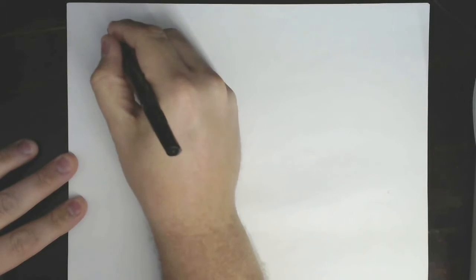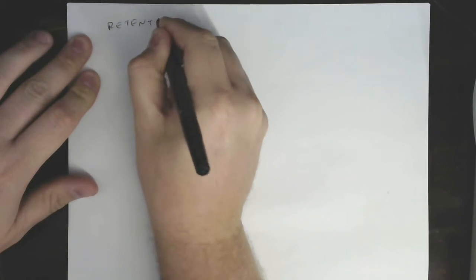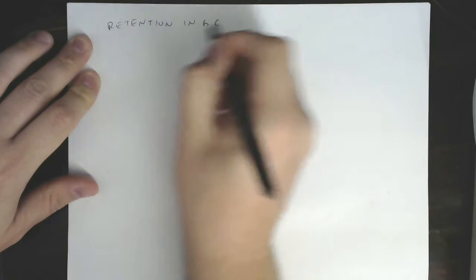Welcome, my friends. We are going to start today by talking about retention in GC. Retention in GC, and what it is that causes different analytes to interact more or less with the column and therefore come out at different retention factors.